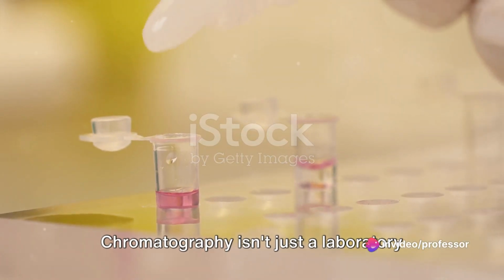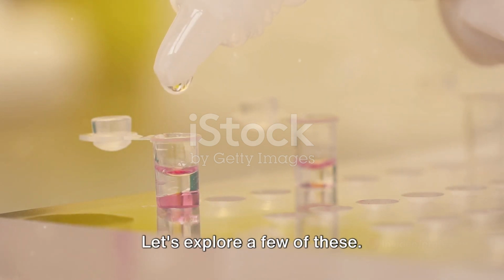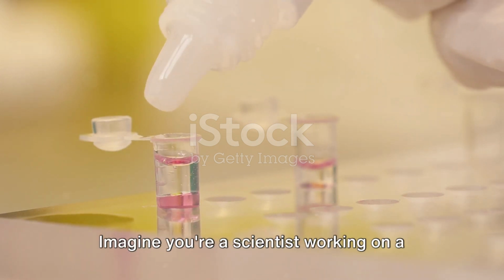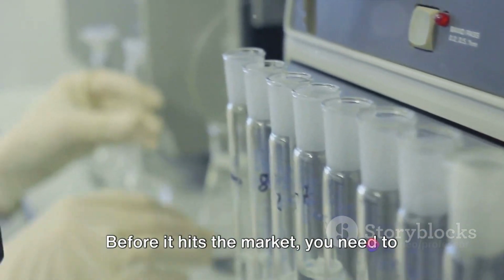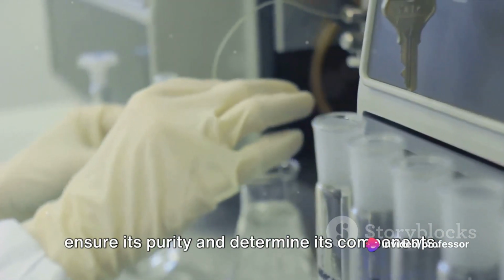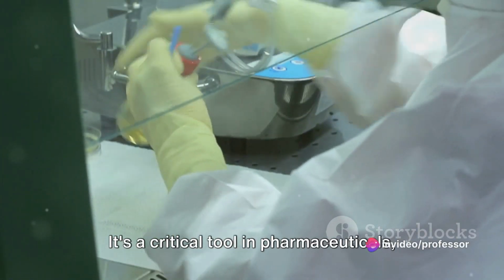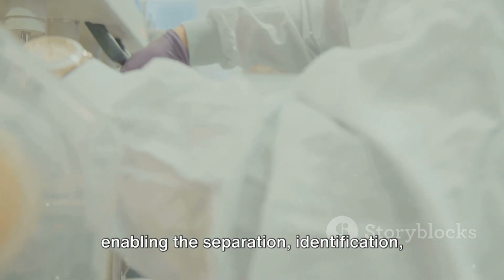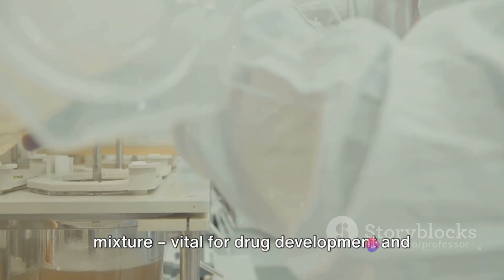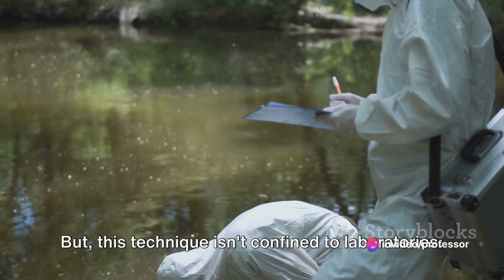Chromatography isn't just a laboratory technique. It has real-world applications that impact our lives. Let's explore a few of these. Imagine you're a scientist working on a new drug. Before it hits the market, you need to ensure its purity and determine its components. Chromatography can help you with that. It's a critical tool in pharmaceuticals, enabling the separation, identification, and quantification of components in a mixture vital for drug development and quality control.